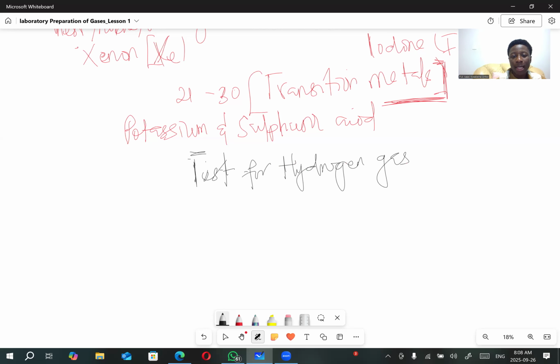We are preparing a gas. Now, in the inverted beaker, cast your mind back. In the inverted beaker, we are concluding hydrogen gas is prepared. How would you know the gas there is hydrogen gas? When you are making stew, you use tomatoes and the paste and stuff. How do you know that the end result is tomato stew?